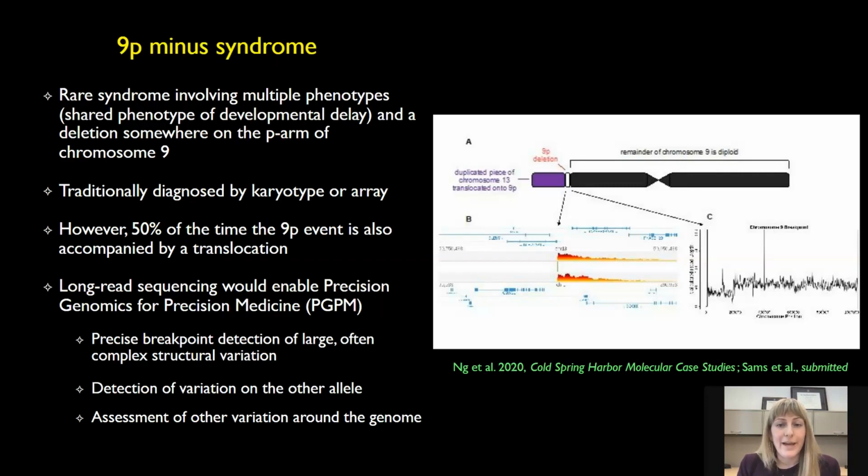Because I don't know that we can ever get to precision medicine for genetic syndromes until we can do precision genomics. And that, I think, is going to be possible now with long-read sequencing.